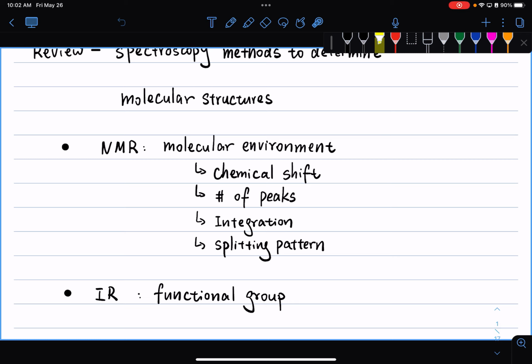group. So we went over two of the most iconic peaks in your IR spectroscopy, namely the OH stretching, which is over 3,000 wave number. It's a really broad and big peak on your IR spectrum. And then also the carbonyl absorption peak around 1,700 on your IR spectrum. That's a really sharp and also intense peak. So by looking at your IR spectrum, you're not going to be able to identify every peak, but you can figure out some useful information by looking at the spectrum.